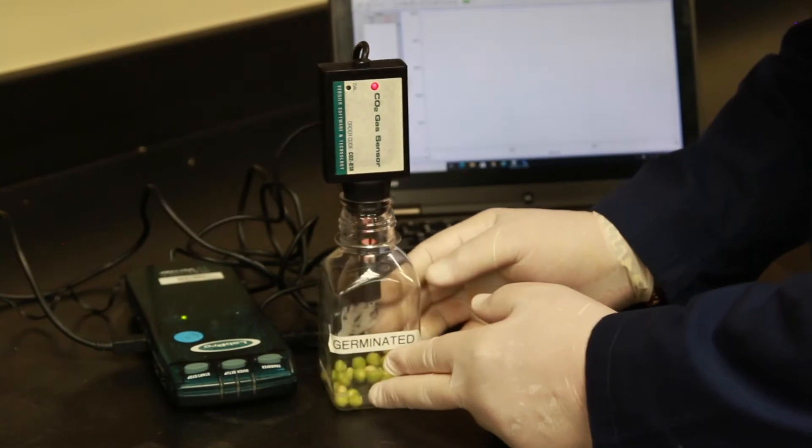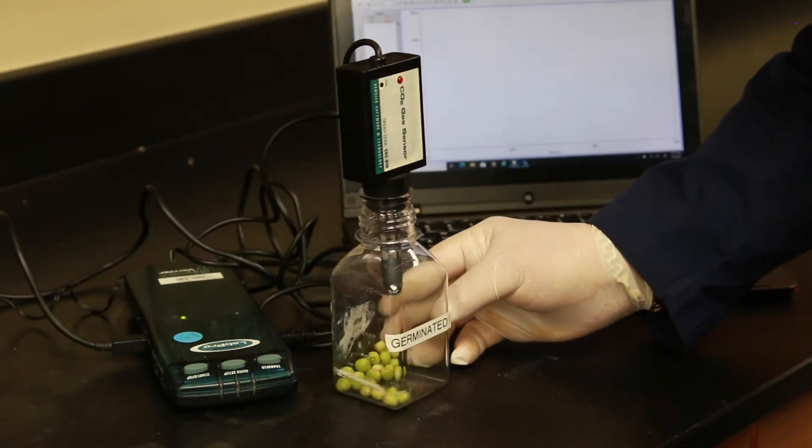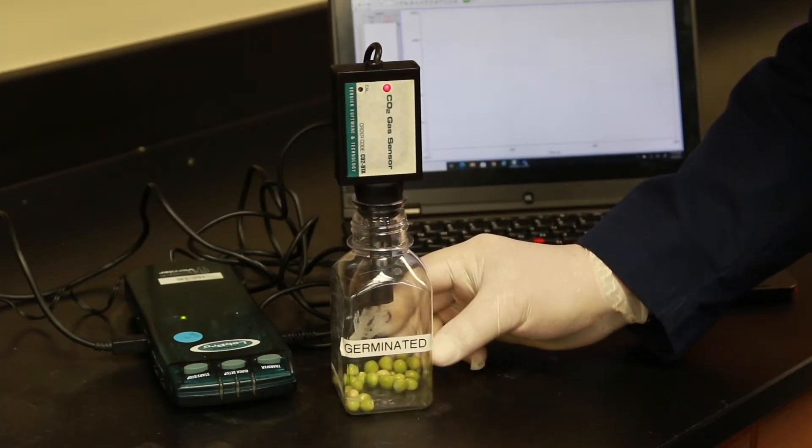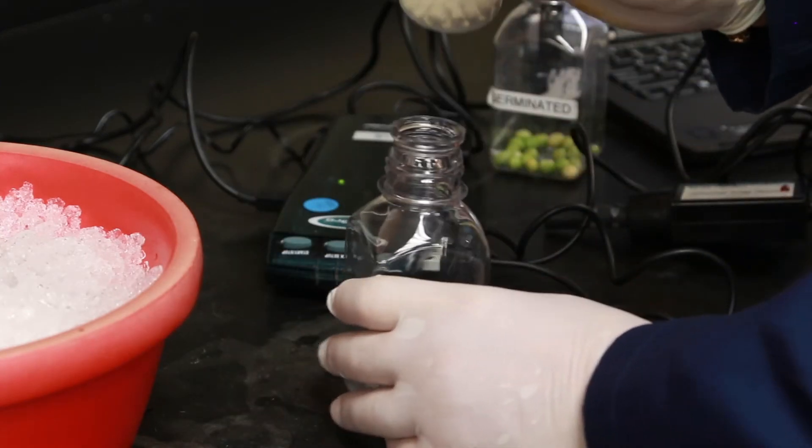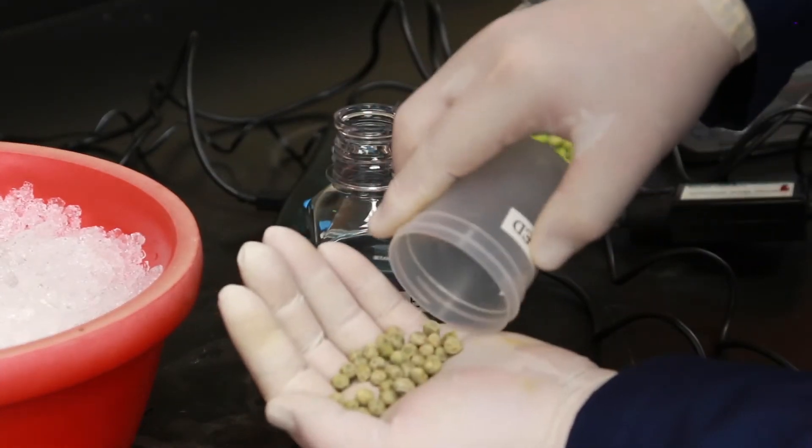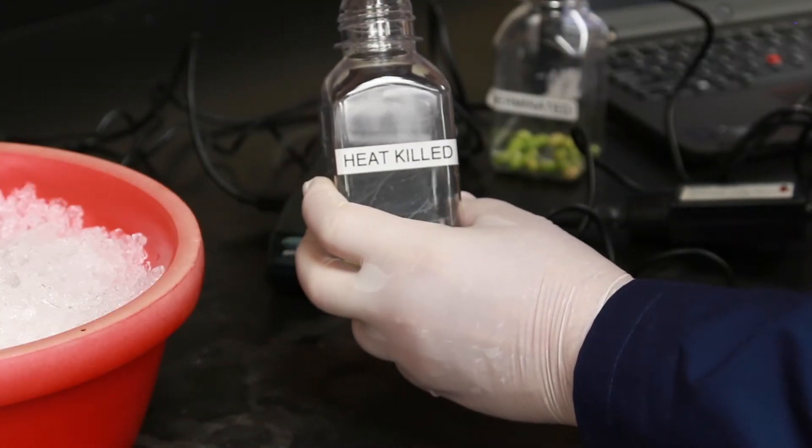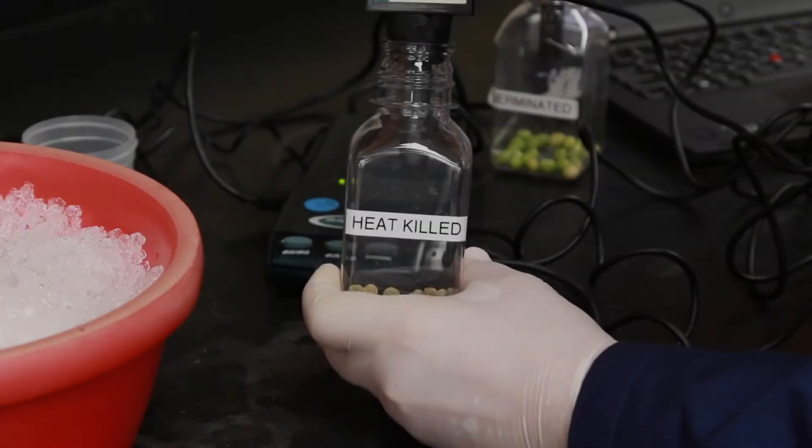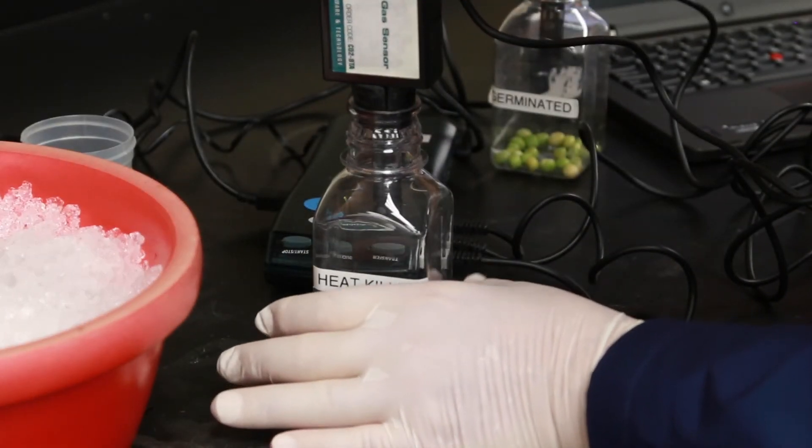While we're waiting for the germinated peas to finish their equilibration we will go ahead and repeat this process with heat killed peas as well as with the cold peas. So we count out 25 of the heat killed peas. They are then placed in their own labeled plastic flask. We add the CO2 sensor and allow that to equilibrate for one to two minutes.